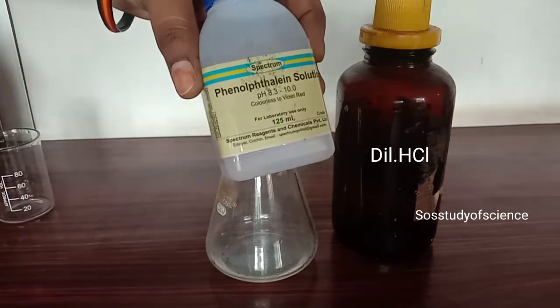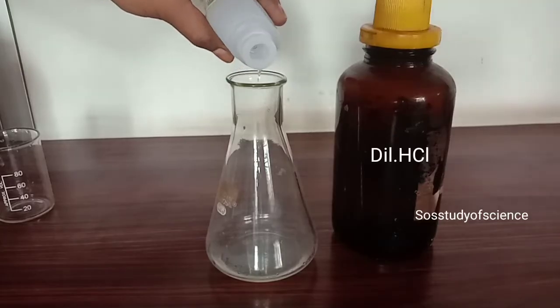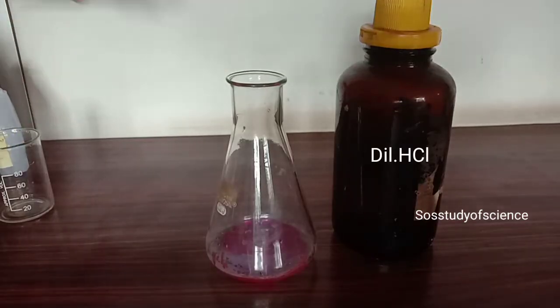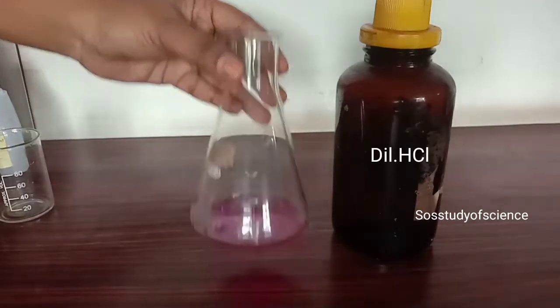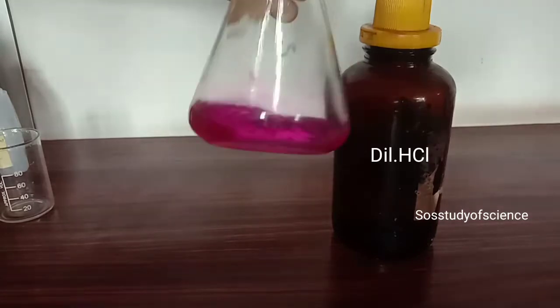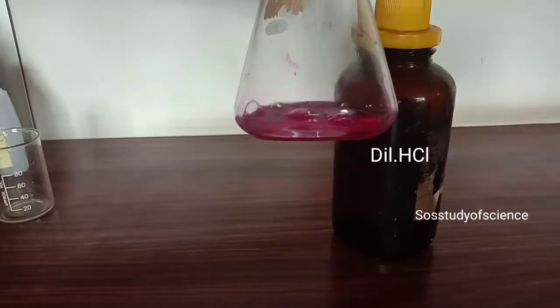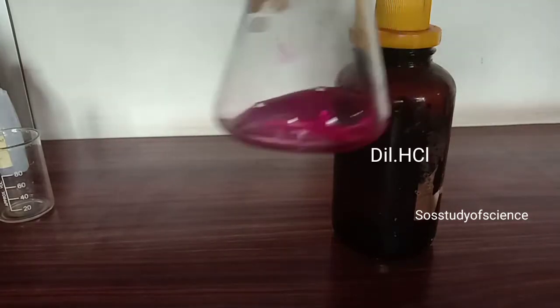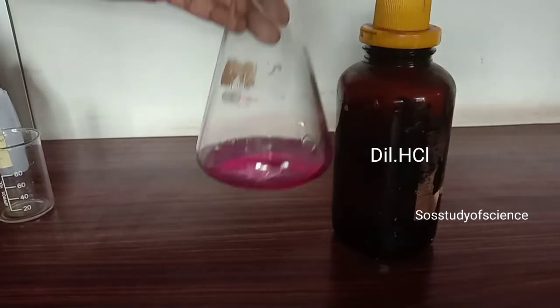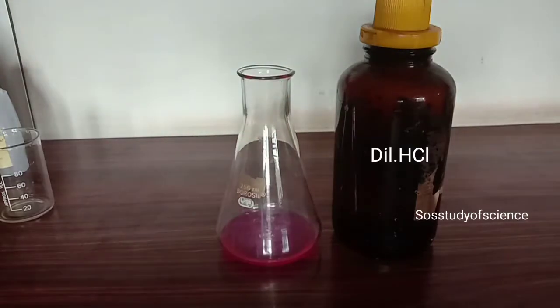Now take phenolphthalein solution, which is an indicator, and add a drop of phenolphthalein to the sodium hydroxide solution. You can observe the solution turns pink in color. Whenever phenolphthalein is added to a basic solution, the solution turns pink in color.